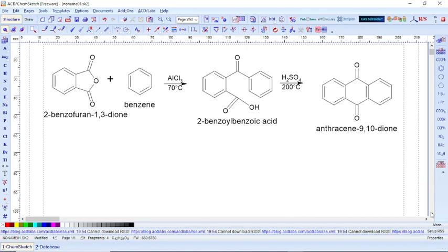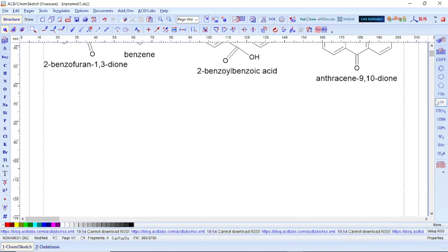Probably let me use a case study of, let's say we have benzene, and we want to react benzene with chlorine.